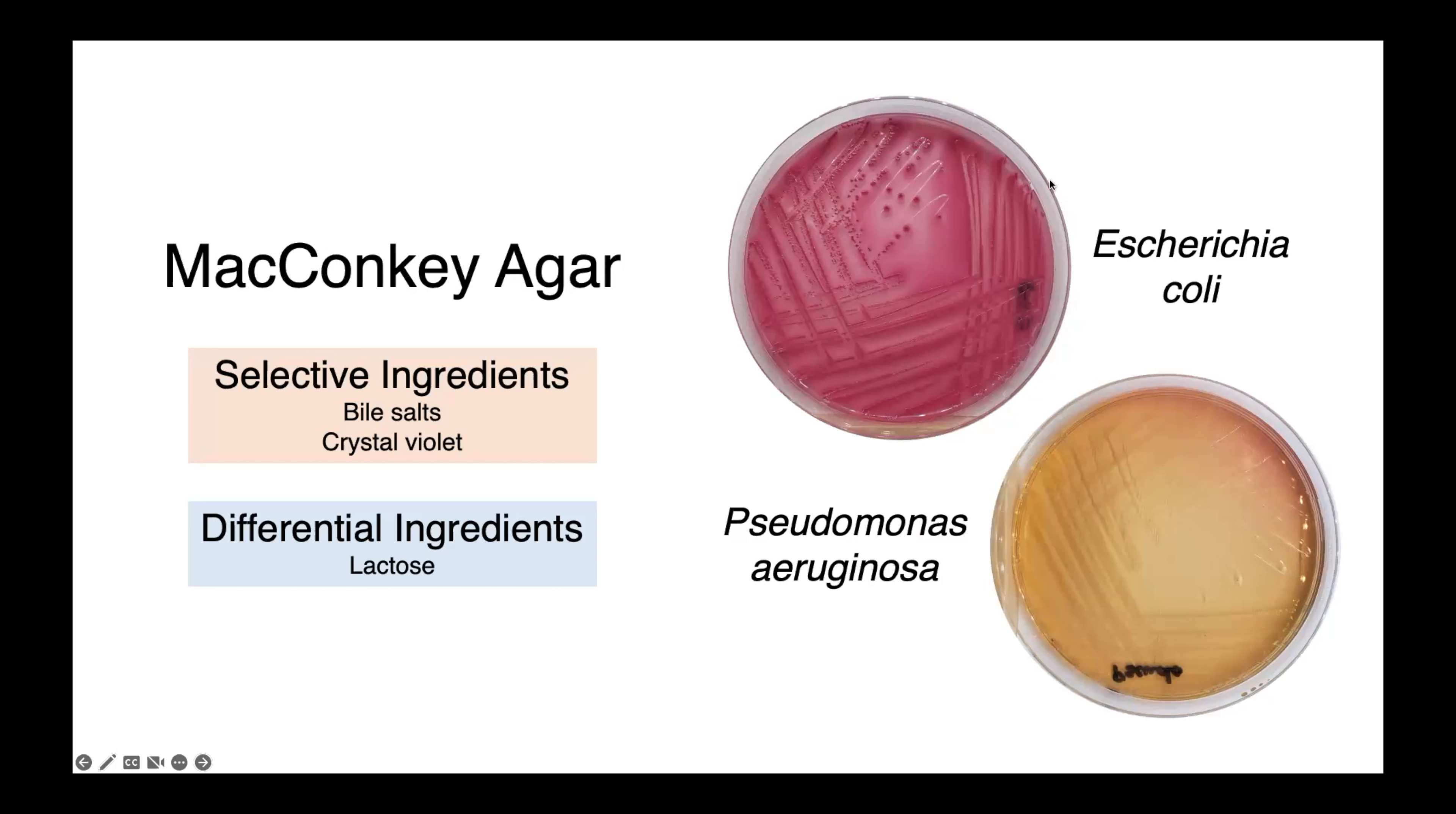On the right, you can see this MacConkey agar plate with a growth of E. coli, these nice bright pink lactose fermenting colonies. And then we have our lactose non-fermenter, Pseudomonas, with clear colonies.